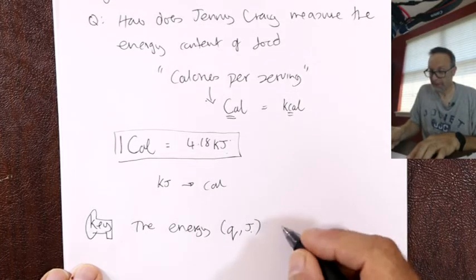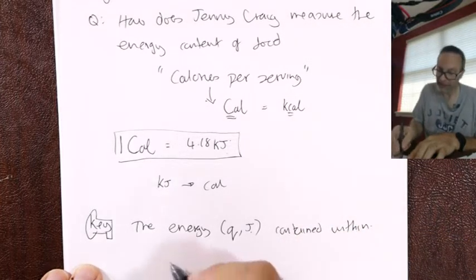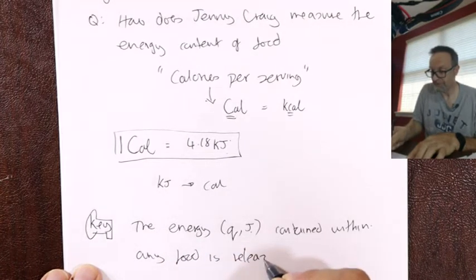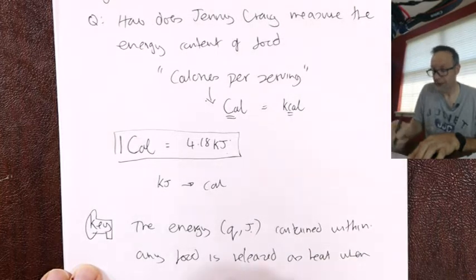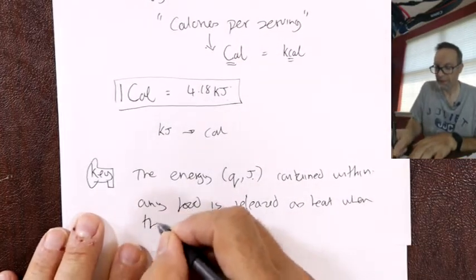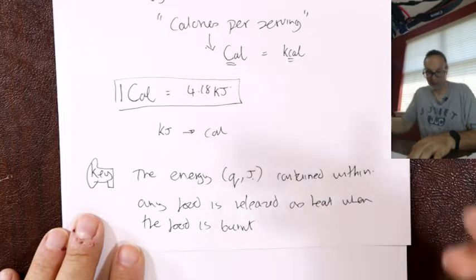The energy contained within any food is released as heat when the food is burnt. Now if you watch those videos, that's the essence of your experiment.